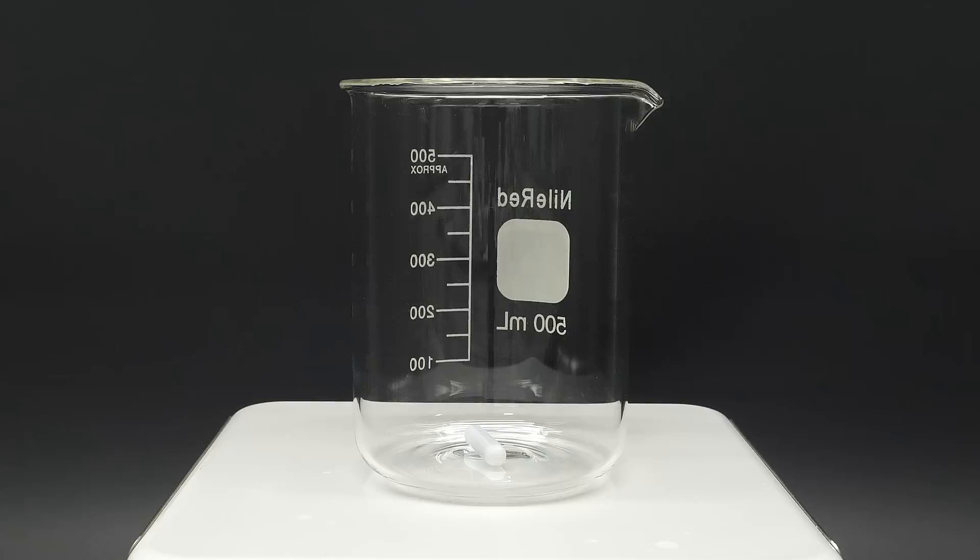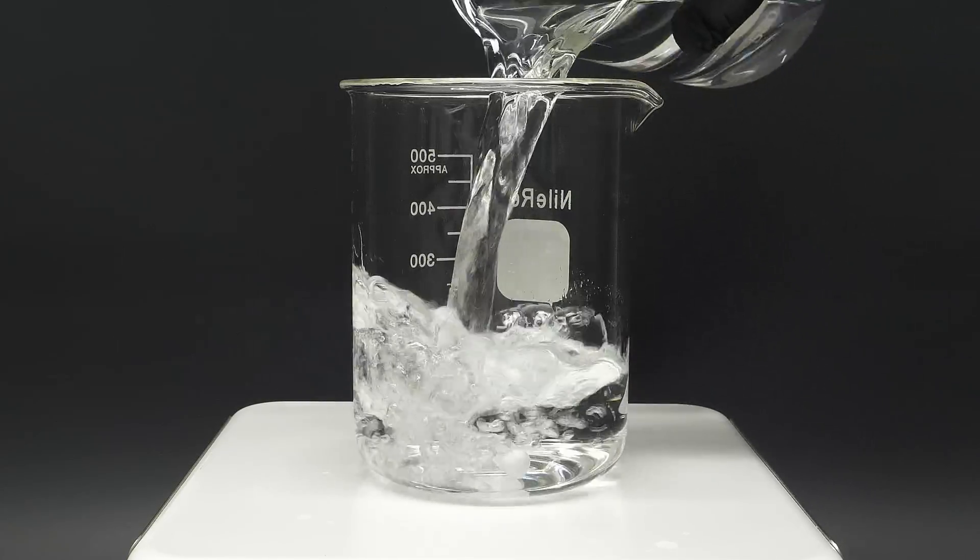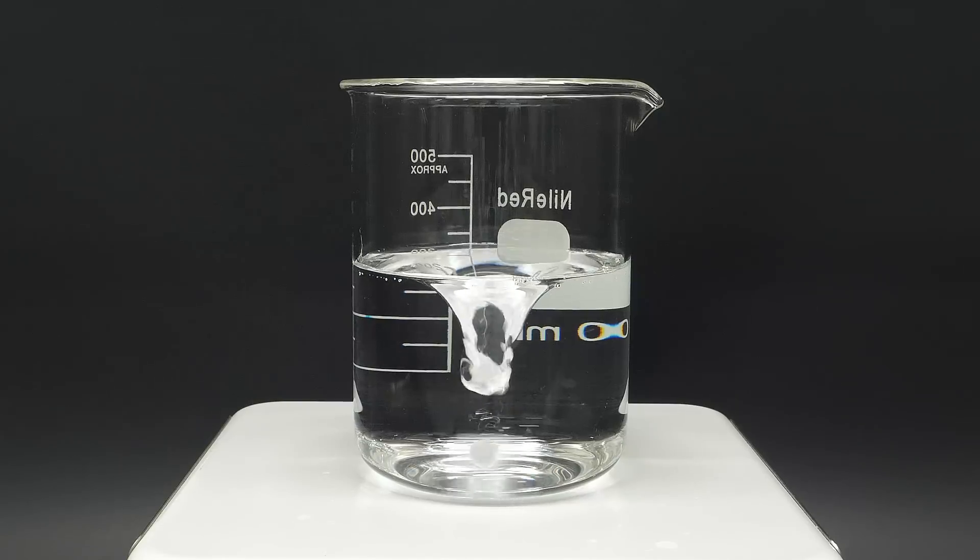For this one, I'm going to try and synthesize a bouncy ball. To get things started, I'll add about 300 mils of water to a beaker, and I'll turn on the stirring.